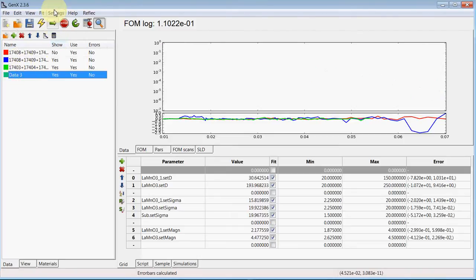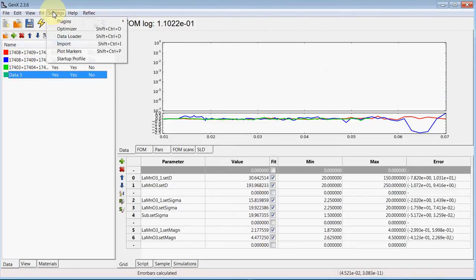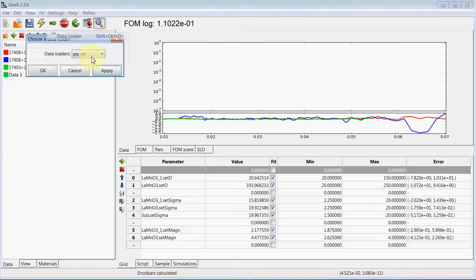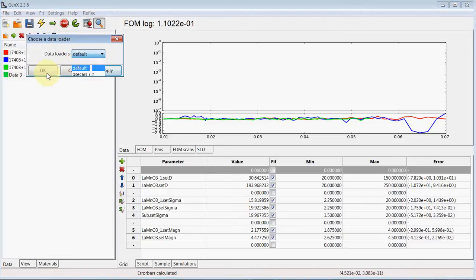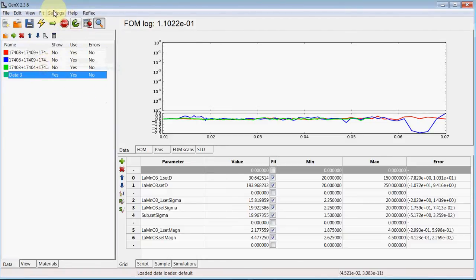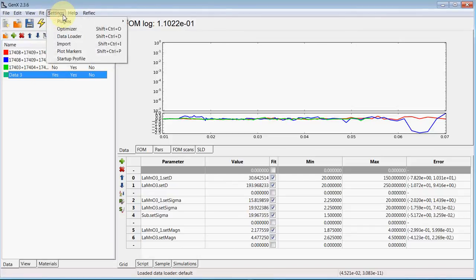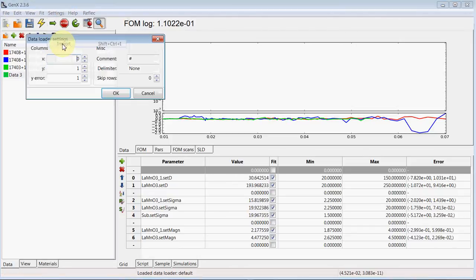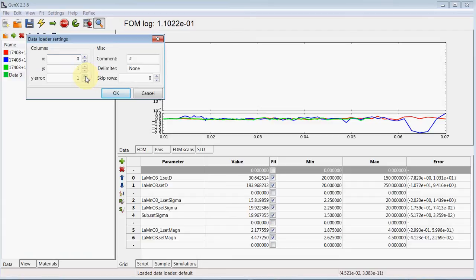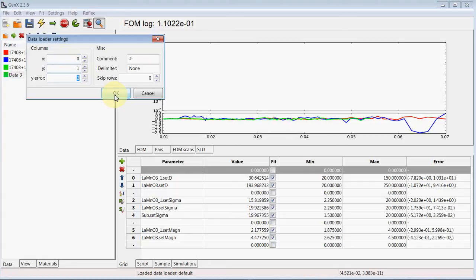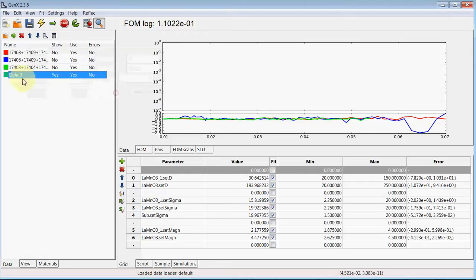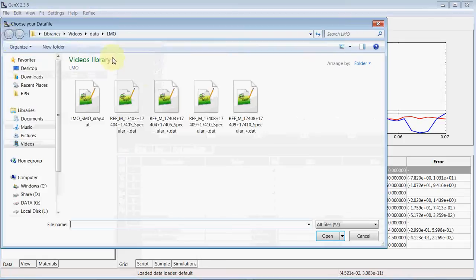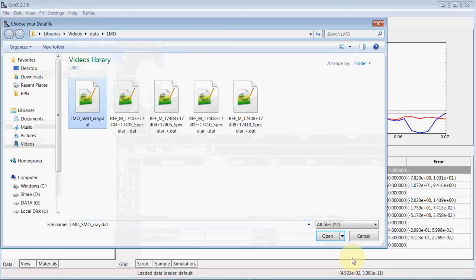We want to load from a standard ASCII file, so we select the data loader default and can use settings import to define which columns to use for X, Y, and Y error. In this case we have 0, 1, and 2, and then we import the X-ray data.